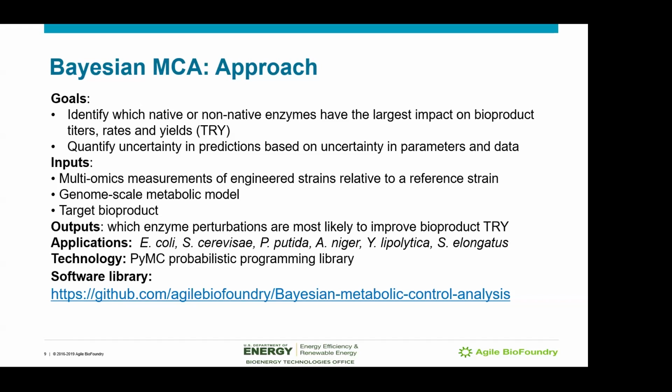So let's go ahead and delve into what the Bayesian Metabolic Control Analysis tool generates in terms of diagnostics and predictive capabilities. Next slide, please.